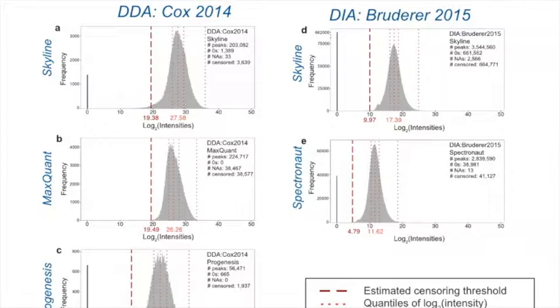We do, but not yet. Okay, I was just wondering if that's what those numbers are. Yes. Well, it's actually a difficult question because it's not always easy to know. For example, we work very closely with Skyline, and we know exactly the convention with Skyline. Skyline will report NA, and so you see here that they only have 33 NAs. Skyline will report NA only if it's a very highly overlapped peak. They will not report NA otherwise. If it's a very low abundant analyte, they will find some low number.